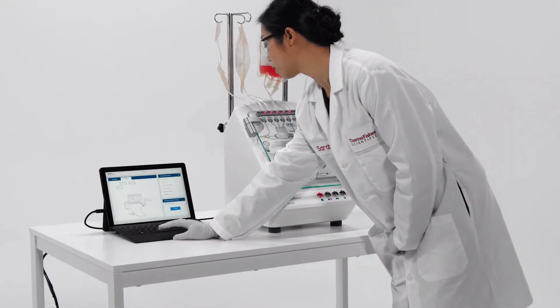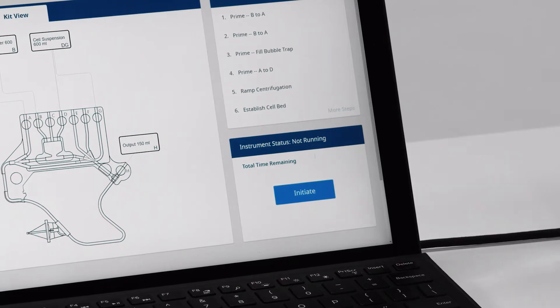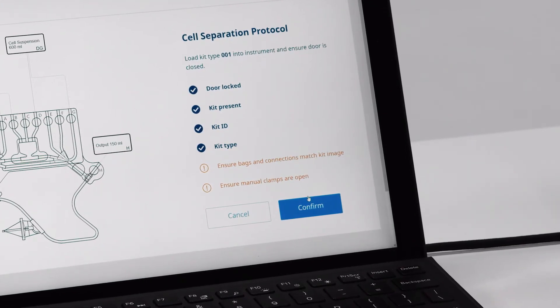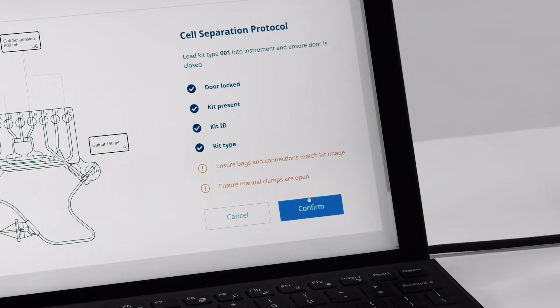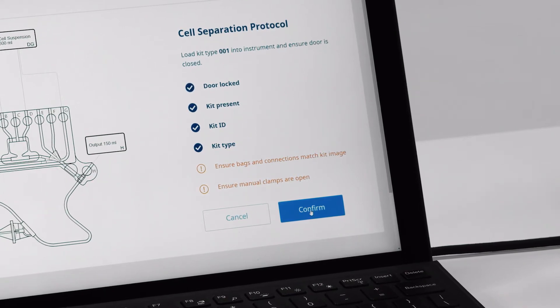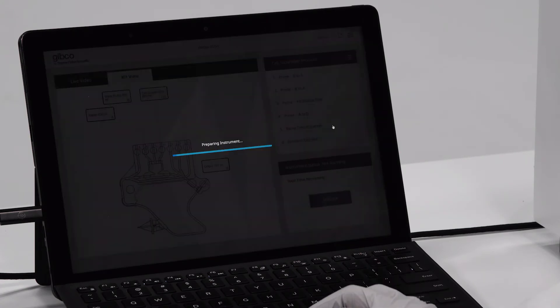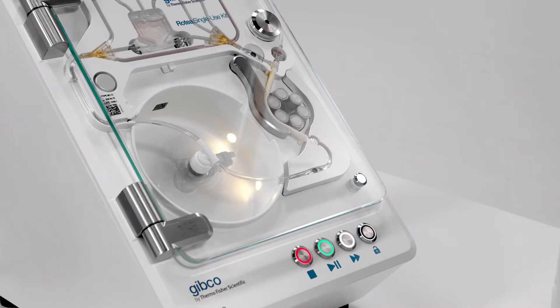Fourth, run the operation. Begin by hitting initiate on the tablet. A checklist will appear. The first four items are instrument checks. They'll have red X's instead of blue check marks if something's not right. The last two items are things you need to verify. Once you do, you're prompted to hit start on the instrument.